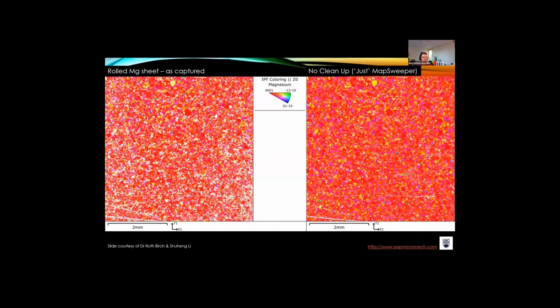So preferably keep the sample holders, etc., in the same room, in the same HVAC system, so you have a consistent temperature, and don't be too much of a rush. You need a little bit of time for things to settle when you're in the microscope for those drift issues. The last bit is that all the data I showed you is from the good days. We've had many bad days, and those are the ones where we just don't show the data and we just have to give up.